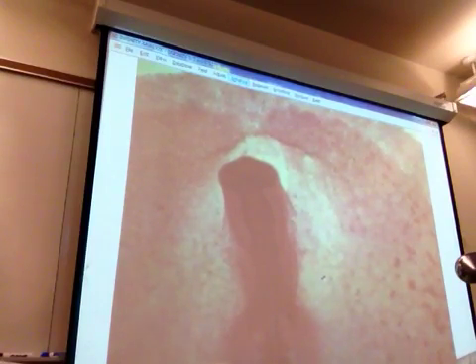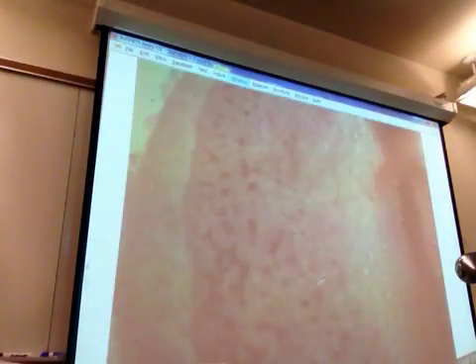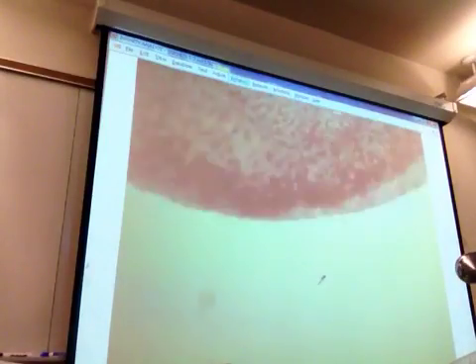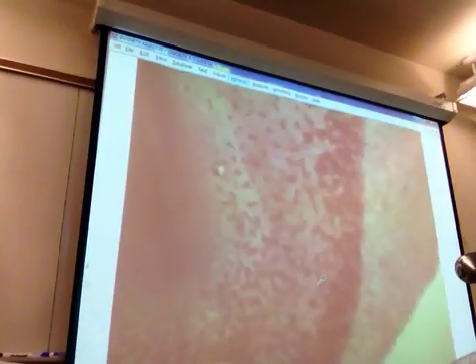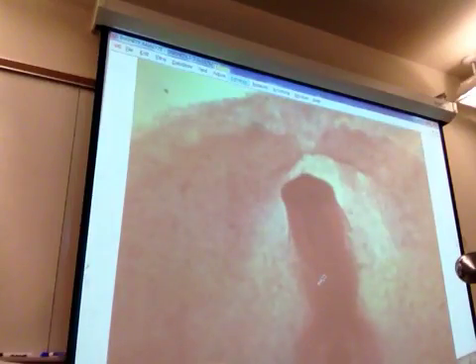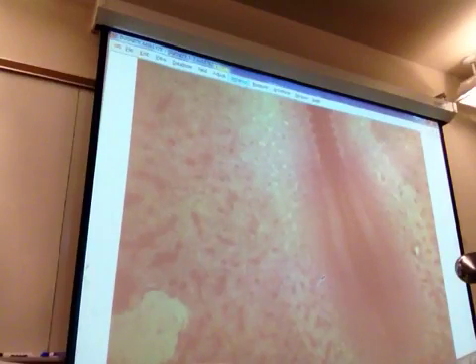Did we change perspective in this slide? No. We're still looking top down because if I pan around, you can still see the yolk all around it. See? You're still looking top down. You can see definite tail. Definite tail.